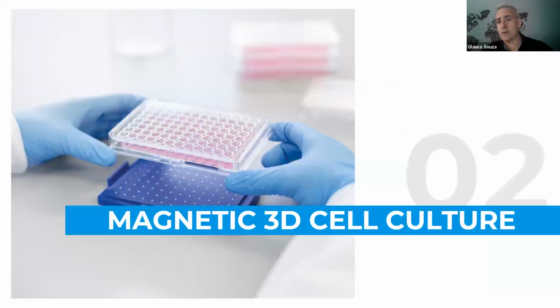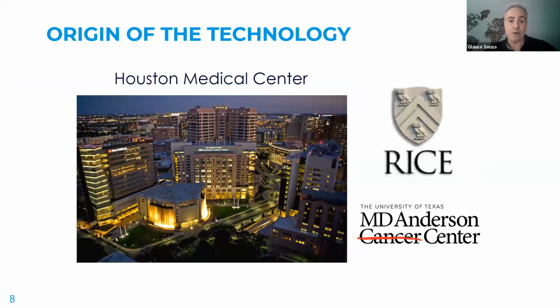Most of what we're talking about are going to be spheroids. So now I'm going to jump into magnetic 3D cell culture.